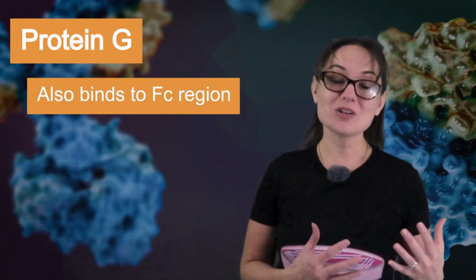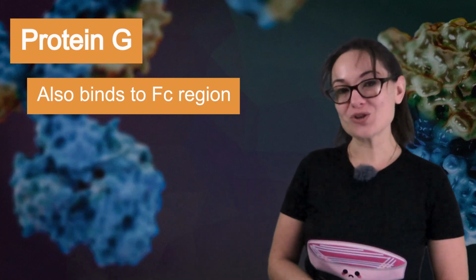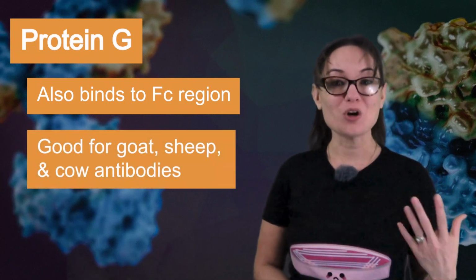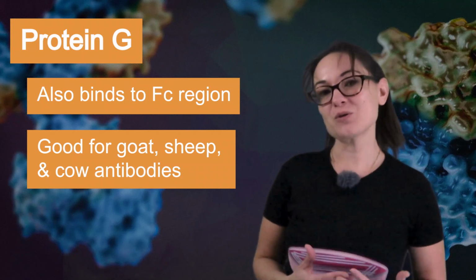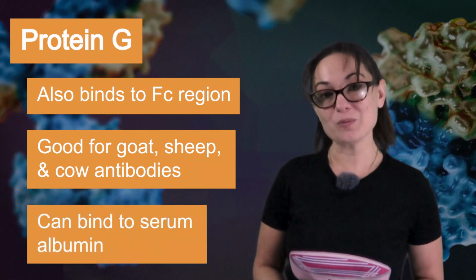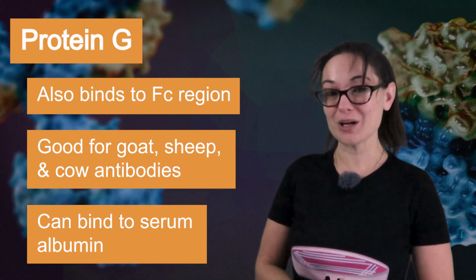The next protein is protein G, which is a surface protein found on certain types of streptococcal bacteria. It binds to antibodies similarly to protein A, but with a broader range. It becomes a great choice for purifying antibodies from goats, sheep, and cows. Just watch out though, because some forms of protein G can bind to serum albumin, which is a super abundant protein that might interfere with your antibody purification.